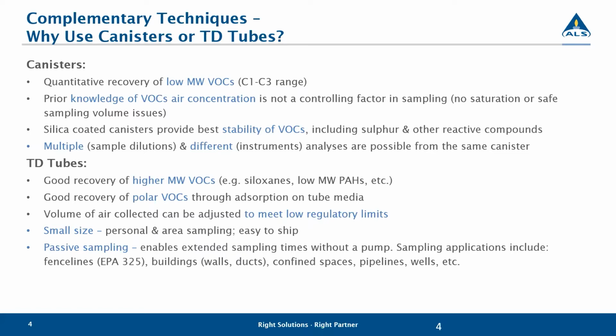The carrier gas on our equipment, just so that you know, is helium. So one of the reasons that we cannot provide helium is that we use it as a carrier gas on our instrumentation, and so it doesn't work really well because it tends to be ubiquitous. However, we've actually been able to set up an instrument separately in a separate room, and we will be offering helium and hydrogen analysis soon out of the Waterloo location. Currently, we can provide that out of Edmonton. So as a client, you just drop the canisters off and we take care of where it has to go, but it will be more local.